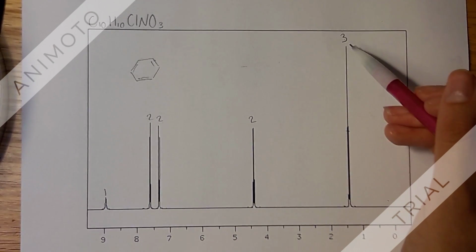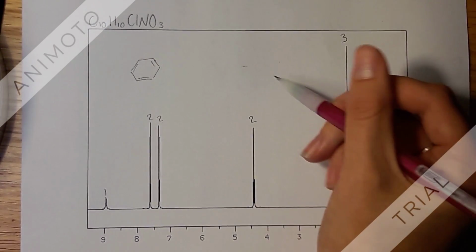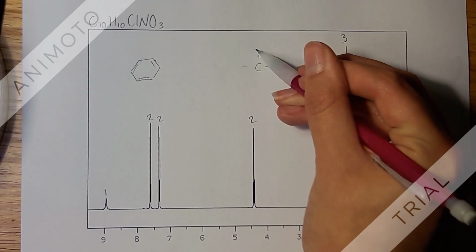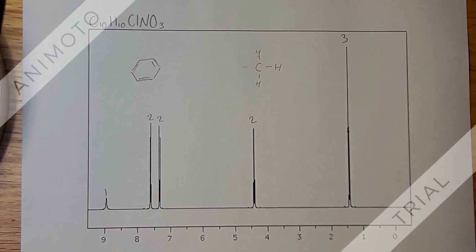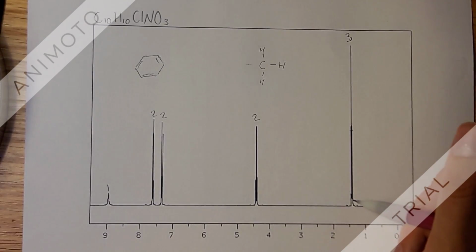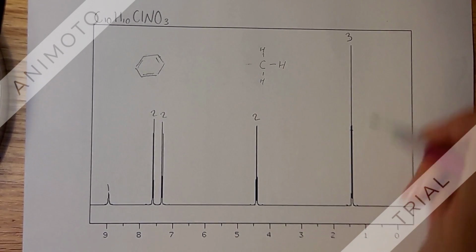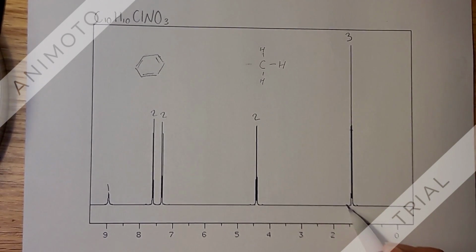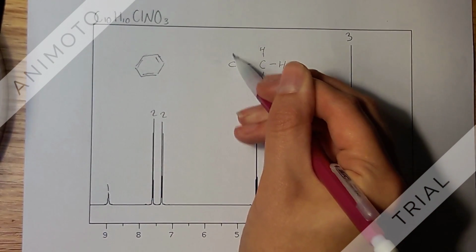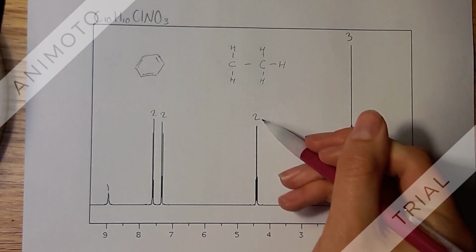Going over here to this alkyl region, we know that there's going to be a carbon, and because of integration it's going to have 3 hydrogens, so it's going to be a terminal alkane with 3 hydrogens. And its integration is 3. So we know that what's next to it has to have 2 hydrogens because the n+1 rule states 2 + 1 = 3. Because there are 3 peaks here, there are 2 small peaks on either side plus this larger peak. So that tells us there's most likely going to be a carbon here with 2 H's on it, which accounts for this peak right here.